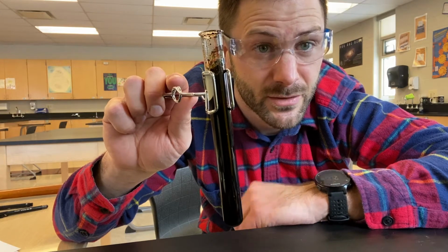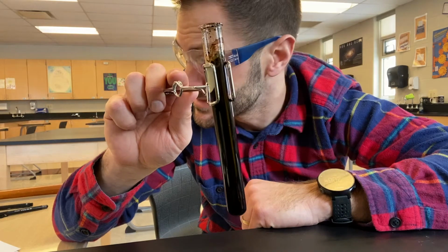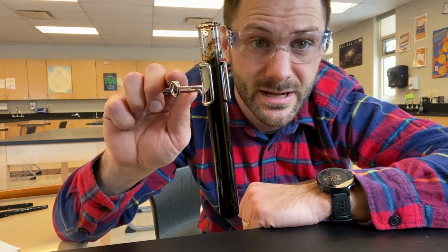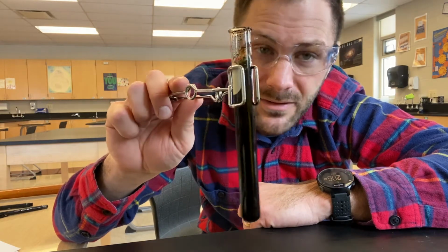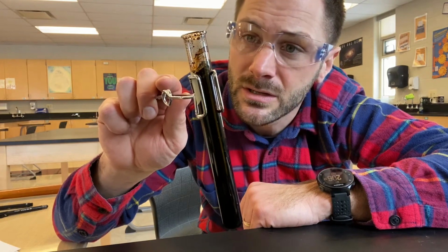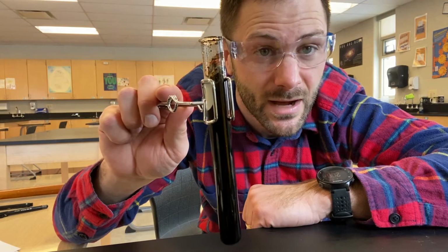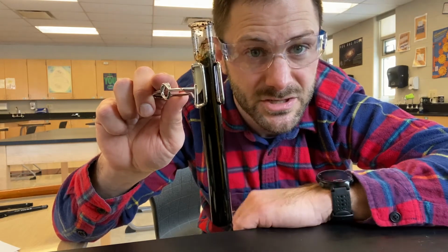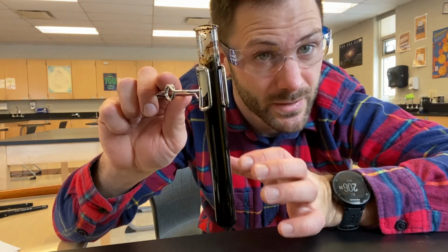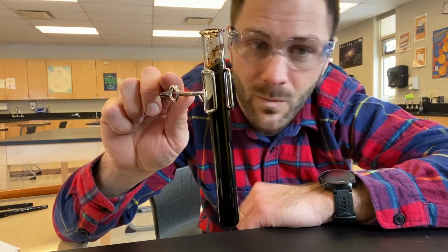They're going to be made of either carbon, hydrogen, or oxygen, because if sugar was C12H22O11, we knew it was made of carbon, hydrogen, and oxygen. And unless there was some unknown reactant in this test tube that reacted with the sugar, we know that those atoms are going to have to be accounted for. Something called conservation of mass. The mass of the atoms going into the reaction in the reactants has to be the same in the products, whatever's produced. Why am I doing so much talking?